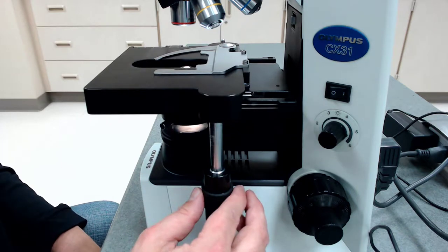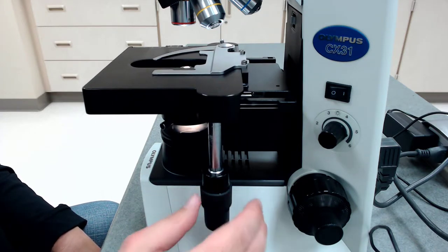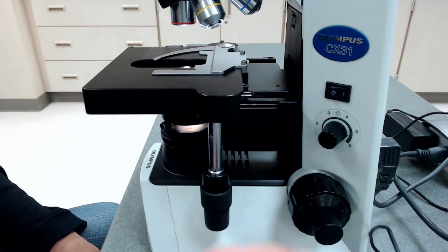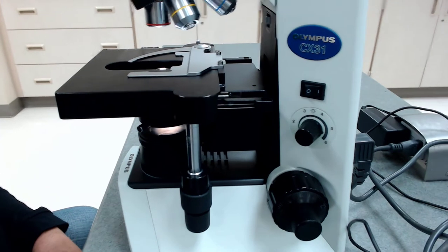So this is how you can control the stage forward and backward, side to side. But the most important knobs on here would actually be down here. Let me turn this a little bit. So you've got, this looks like one knob, but it's actually two on this microscope.